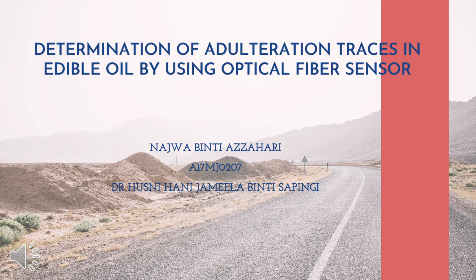My title for final year project is Determination of Adulteration Trace in Edible Oil by using Optical Fiber Sensor.